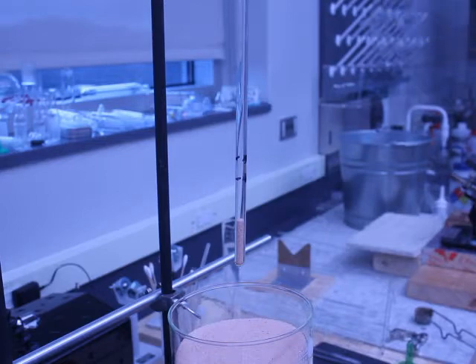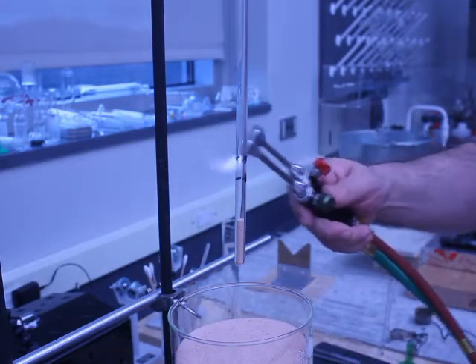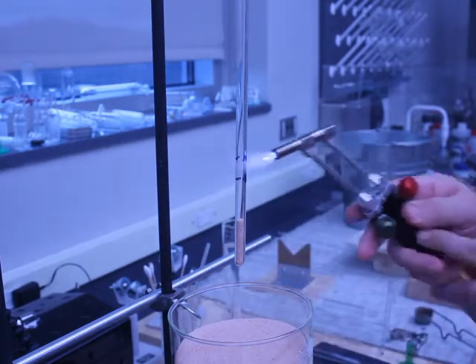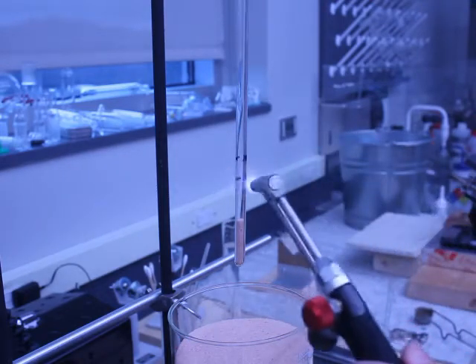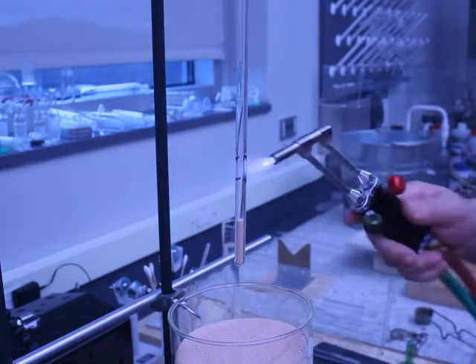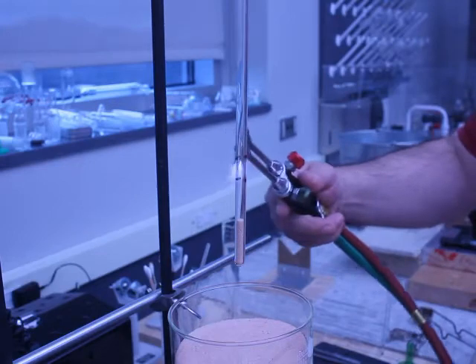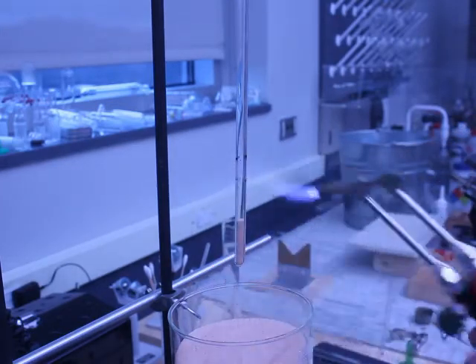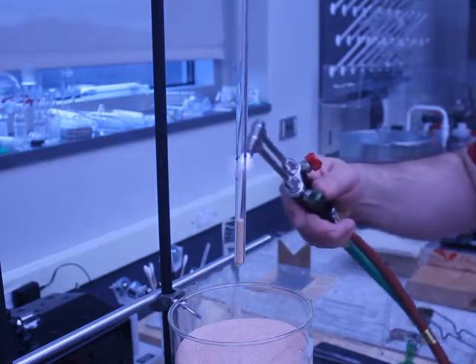So what I'm going to do now is I'm going to be moving the hand torch back and forth, warming up this glass. And I'm trying to only heat a relatively small area of the glass, but I don't want to get it too hot too quickly, because since the glass is under vacuum, once it becomes liquid, once it becomes soft, it's going to collapse on itself. But that's actually part of the plan.